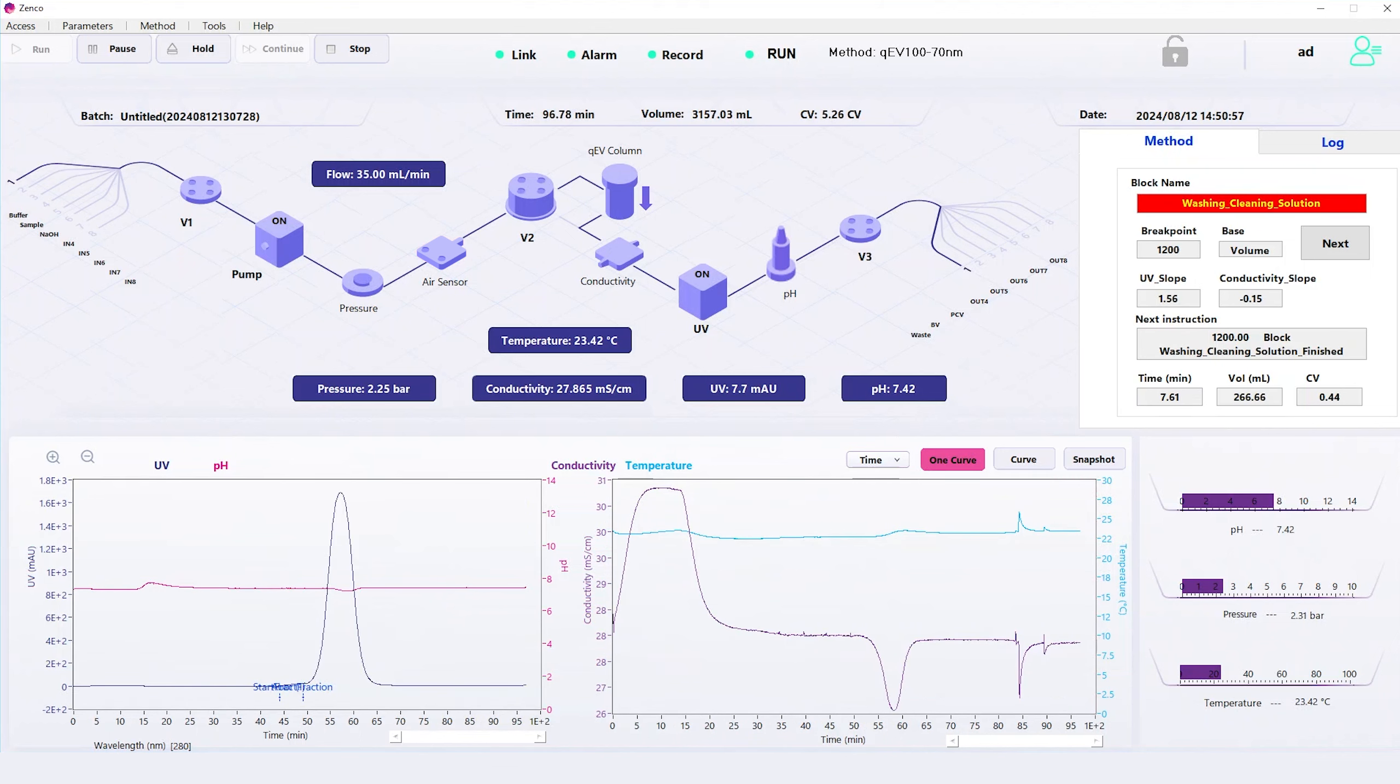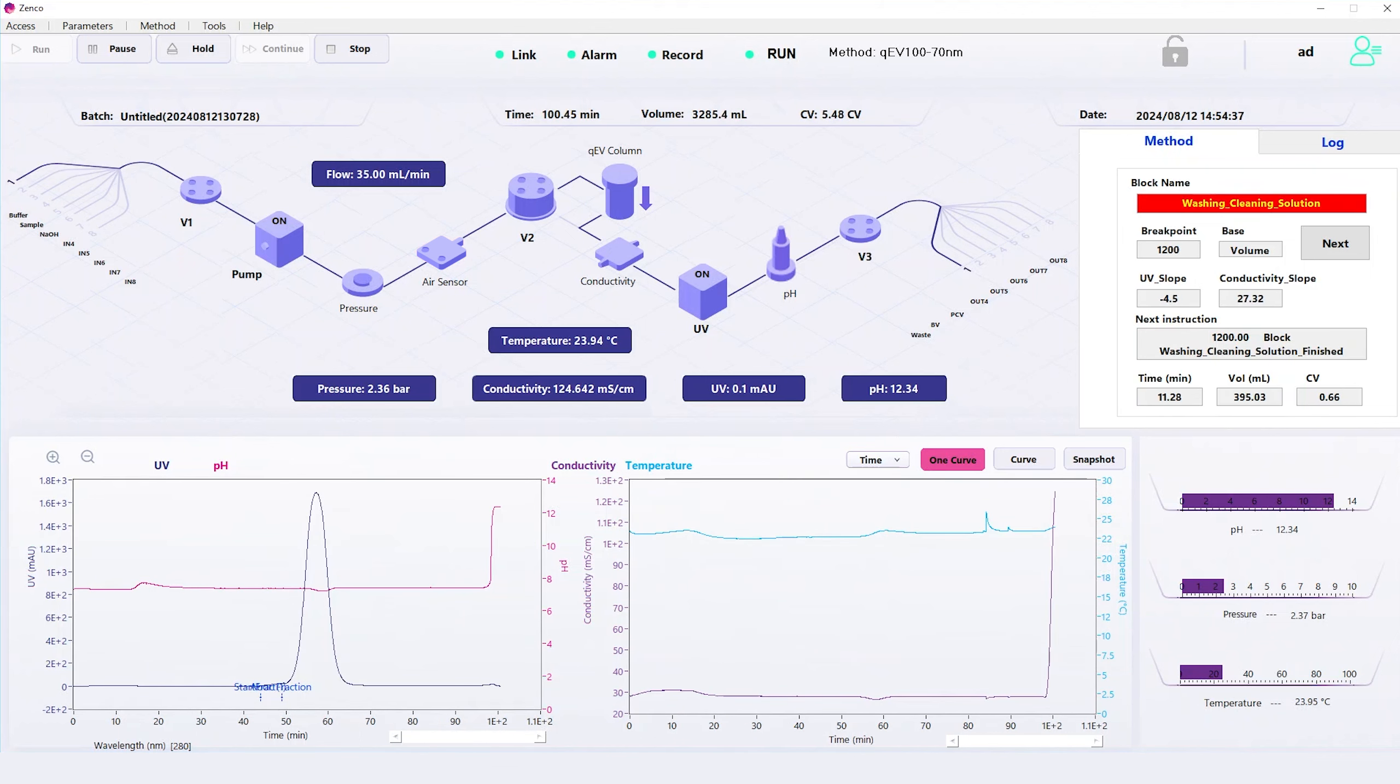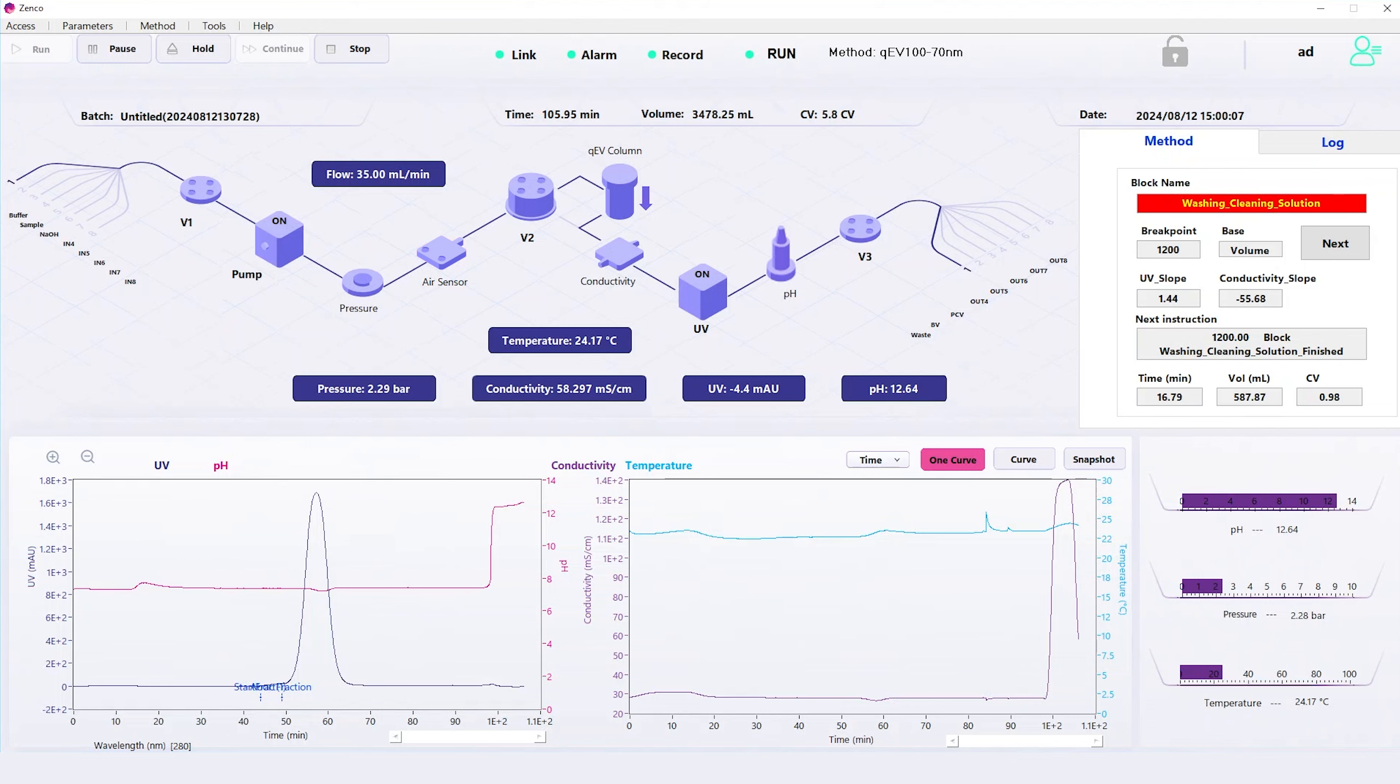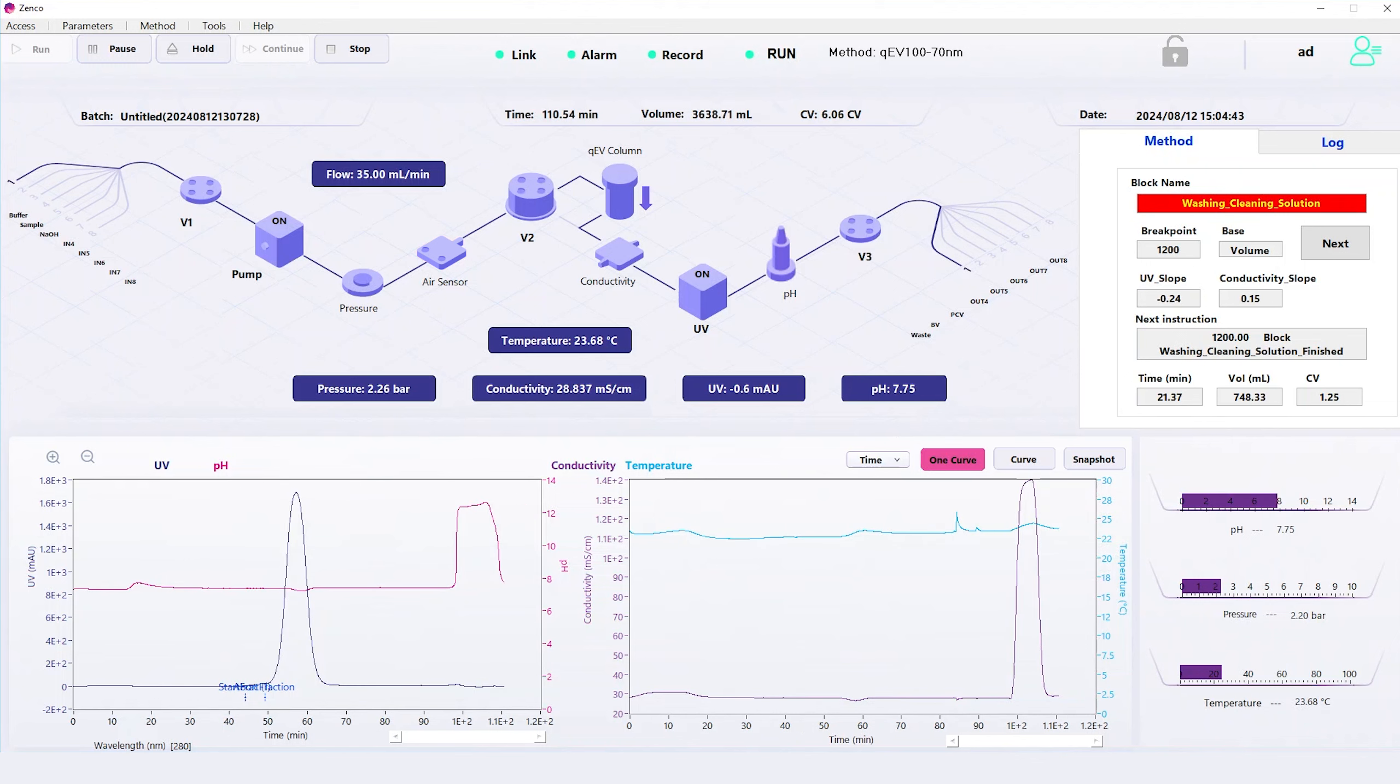The QEV Zinco has now switched to cleaning mode, starting with buffer. Sodium hydroxide then flows through the unit, causing a dramatic pH shift. Once the cleaning solution is flushed out, the pH returns to physiological levels, preparing the tubing and column for the next round without residual contamination.